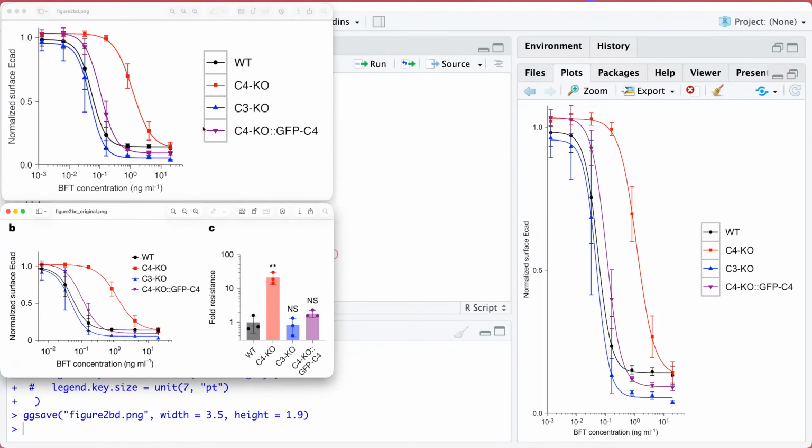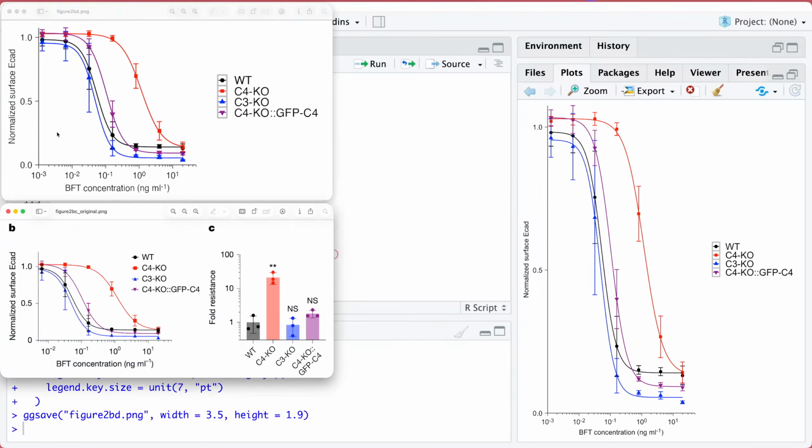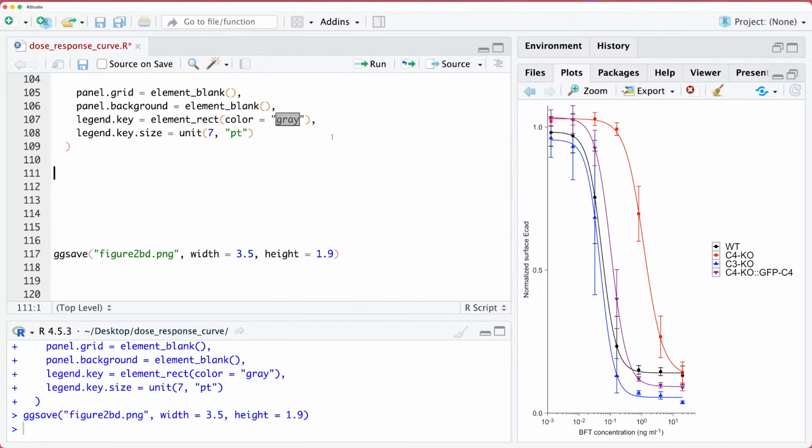And this then shows me basically the size of the key, right? And so the full size is what's separating the different lines of the legend, right? So if I then come in here with legend.key.size and go to like 7, I now see those squares have gotten smaller and we now have not as much separation, right? So I'm going to leave that on just because it's kind of helpful to see these boundaries.